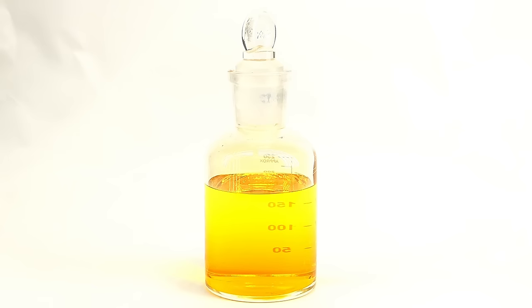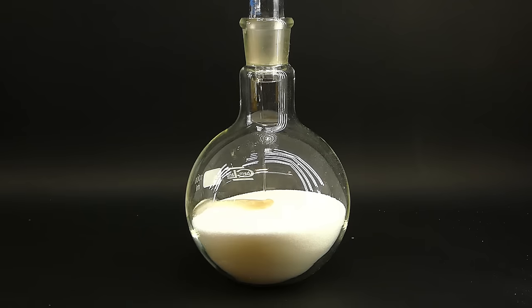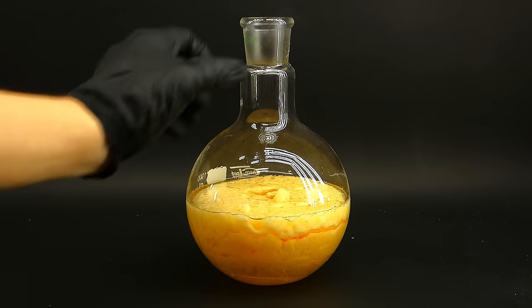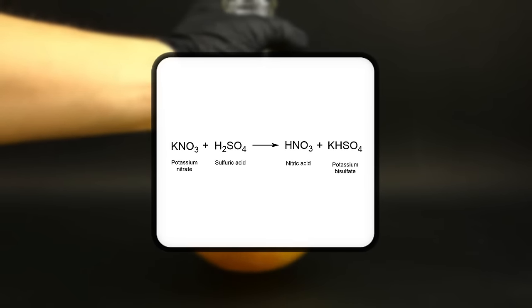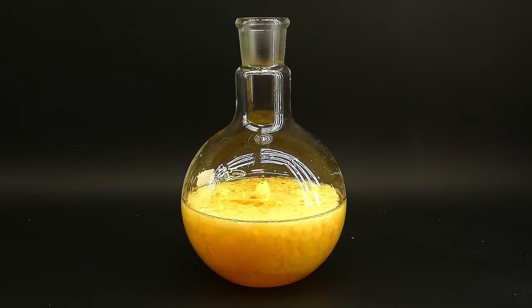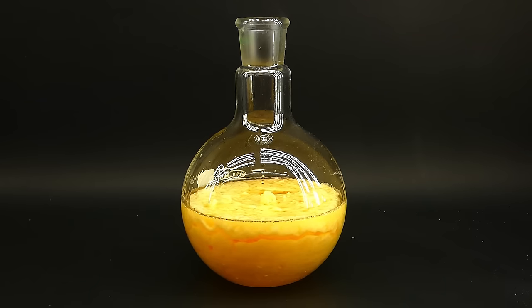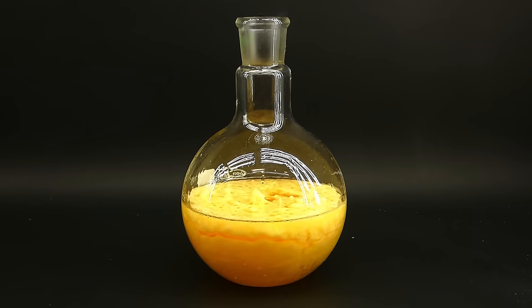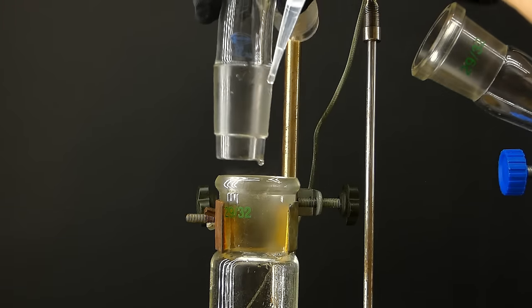To make the pure nitric acid, I decided to go with the classic potassium nitrate method. To start, I added half a kilo of it to a big boiling flask, followed by 280 milliliters of concentrated sulfuric acid, which I extracted from my car battery in a previous video. The whole mixture quickly became orange and got rather hot, which indicated a reaction going on, in which potassium nitrate exchanges the nitro group with sulfuric acid, forming nitric acid and potassium bisulfate.